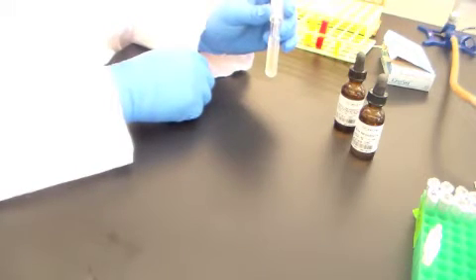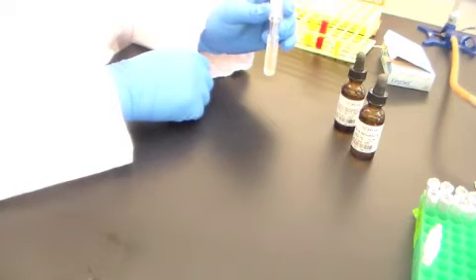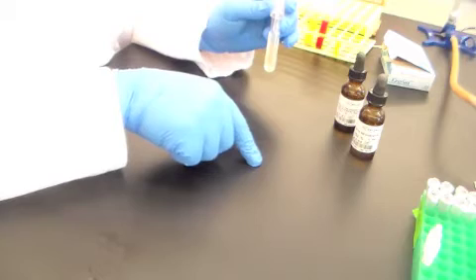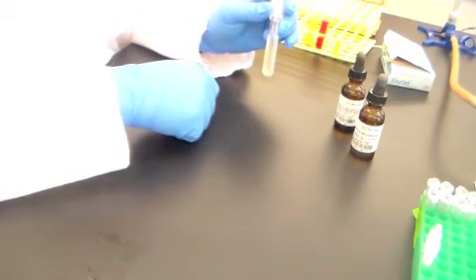That's one possibility. Another possibility in your interpretation of a negative nitrate reduction test is that the bacteria may have reduced nitrate to nitrite and then further reduced nitrite to some other form, possibly a gaseous form.